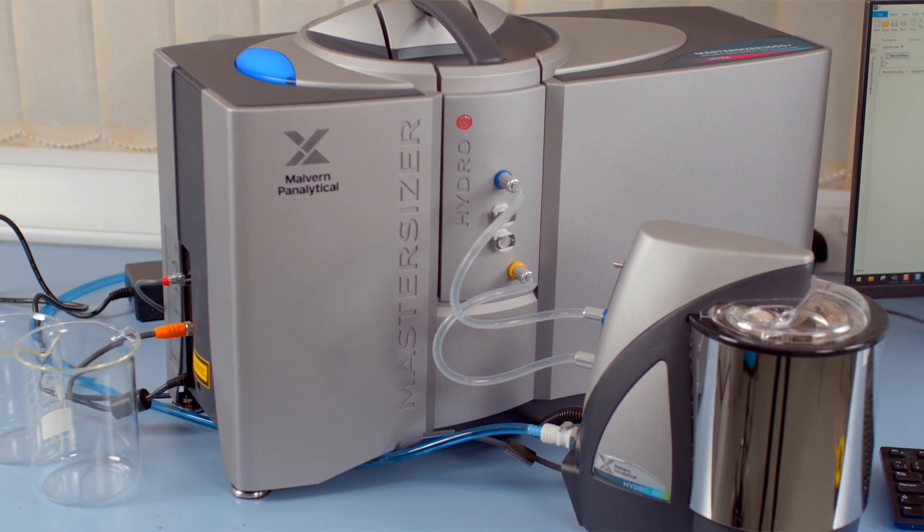The Mastersizer has a long history with laser diffraction, and over many generations we've introduced software features such as standard operating procedures or SOPs on the Mastersizer 2000 and data quality guidance on the Mastersizer 3000. SOP Architect is introduced to help make your lives easier, but this time with respect to method development.